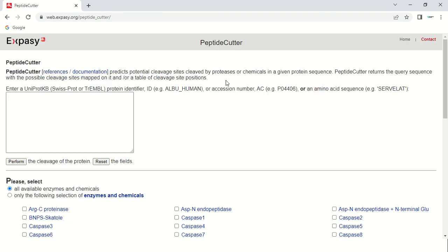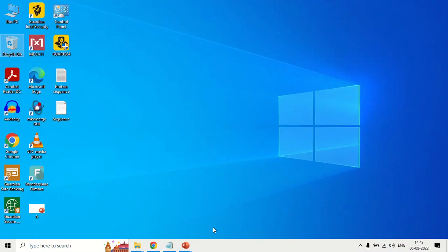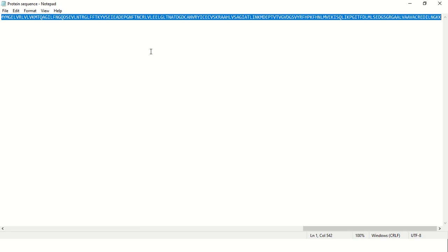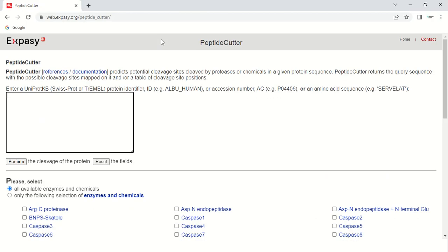This is the homepage of the Expasy PeptideCutter tool. Here in this box, you can either enter the UniProt ID, accession number, or amino acid sequence. I am going to add an amino acid sequence — I have already downloaded it from NCBI. Just copy your sequence and paste it into the box.